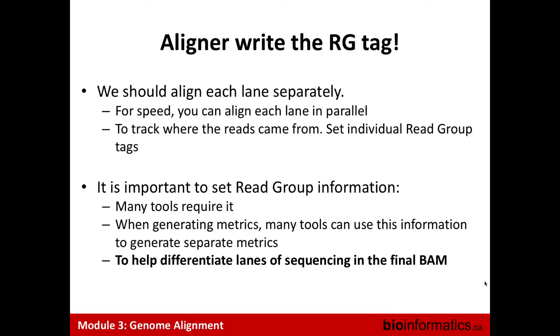Yeah, if you align your reads to a reference, the percentage of your reads that are aligned on the reference with high quality will give you a good idea. And we'll see in the practical. We'll look at the metrics, and there are some numbers you can use. That's the number I use, but it's not a defining number. But I expect for a good reference to have more than 90% of my reads mapped to my reference, and the higher the better.